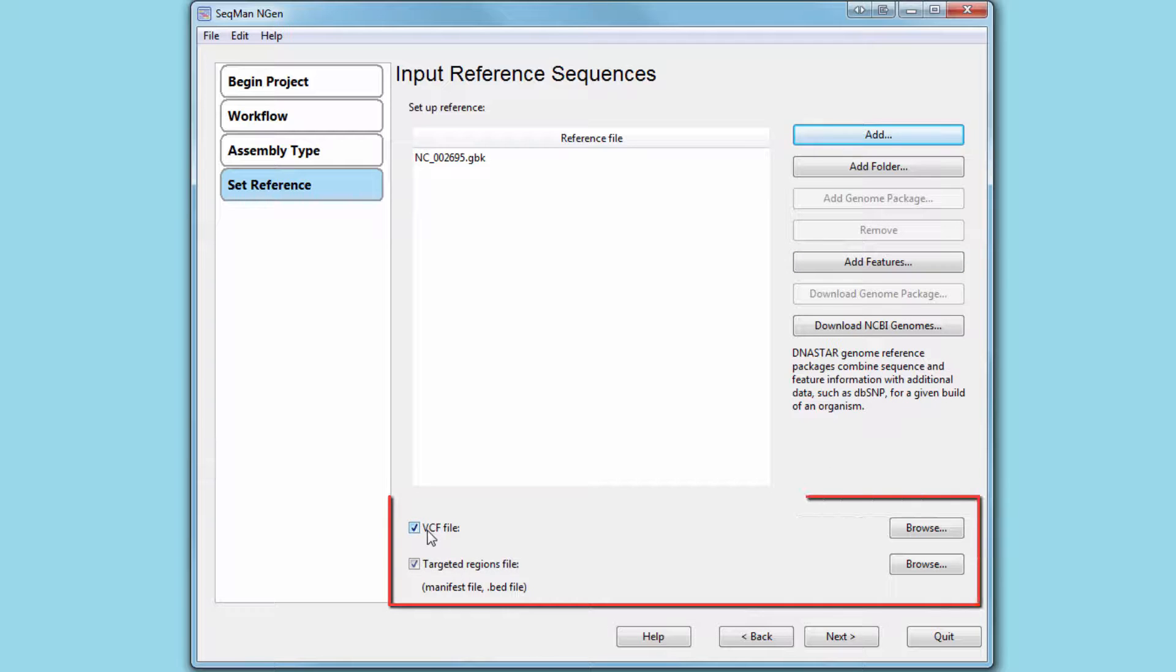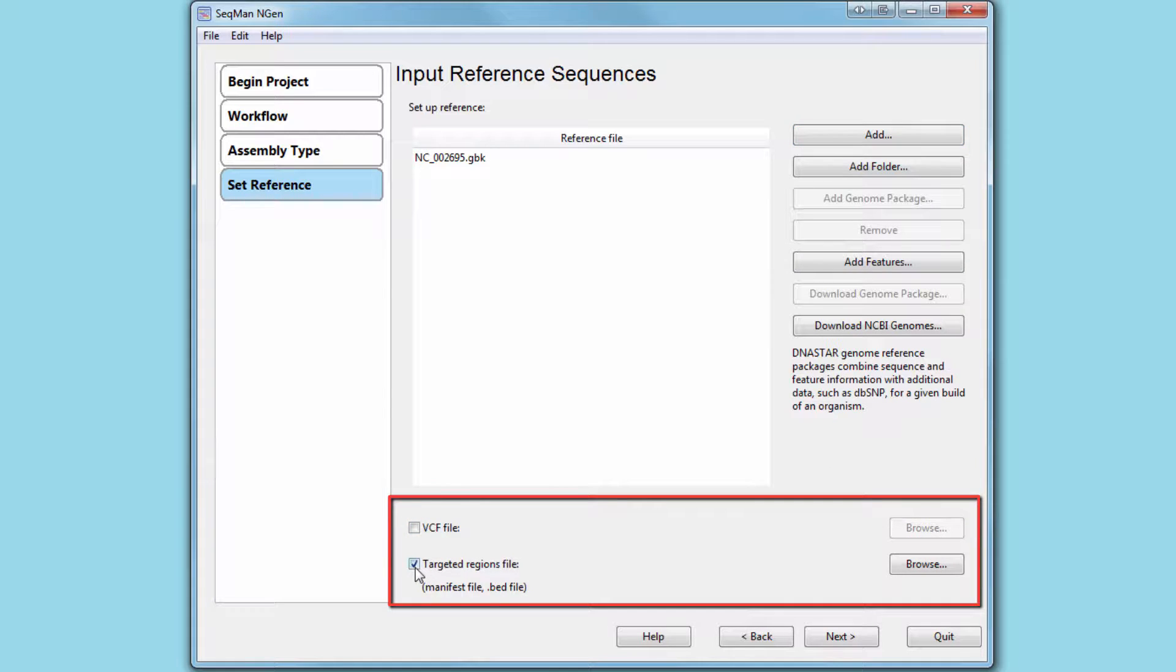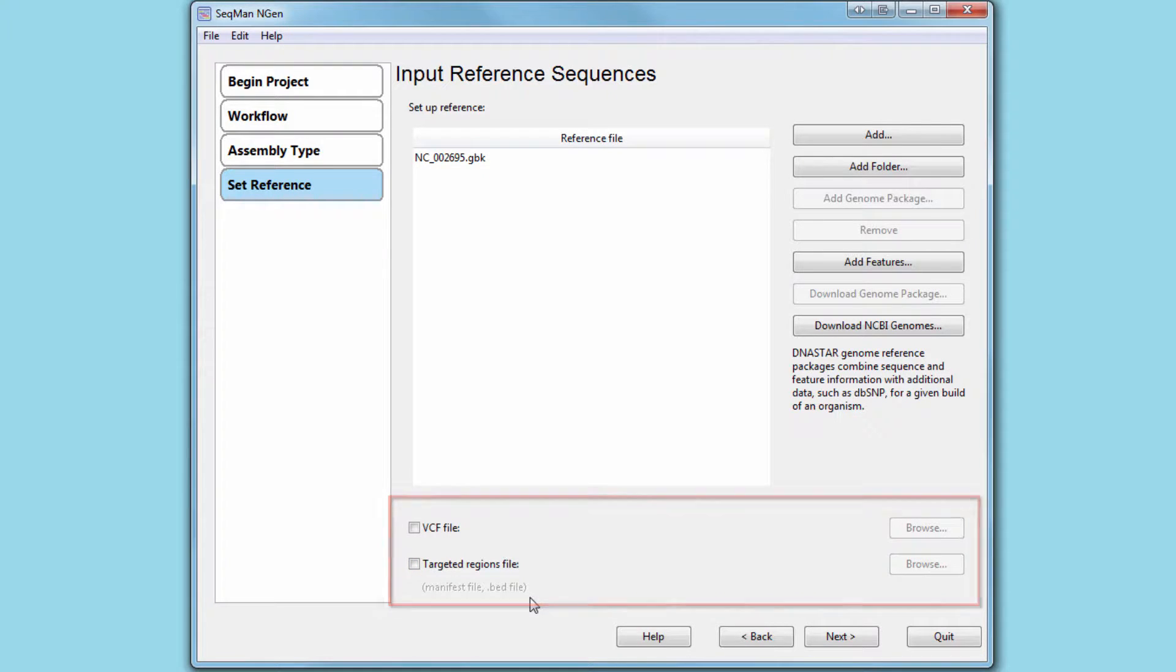Here, you can also load any VCF or BED files that you want to use as part of your analysis.